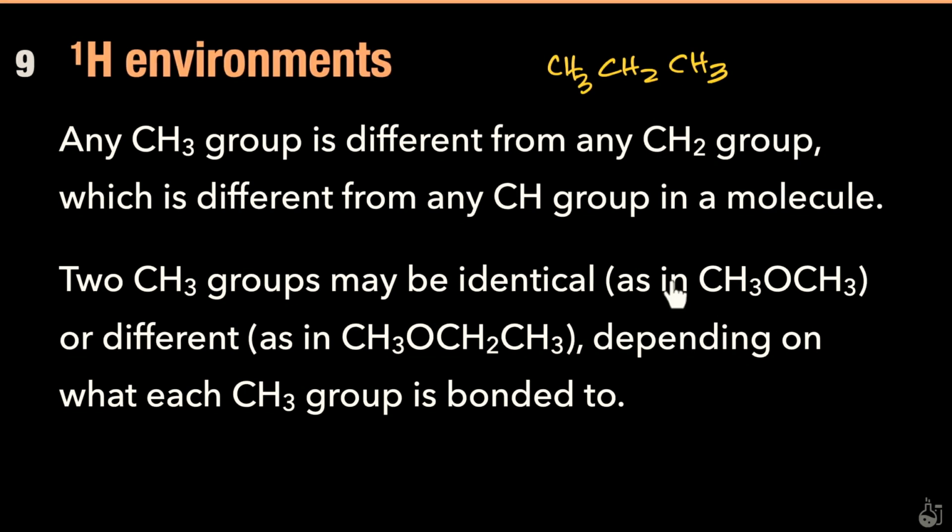By the way, in this case also they're identical. In this case they're also identical. But in this case they are not identical. And the reason is that it all depends on what the CH3 is bonded to. For example, in this case, the CH3 is directly bonded to an O. If this structure we've not done in chemistry before, but its bonding looks like this.